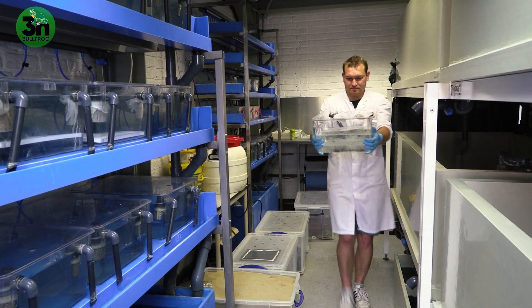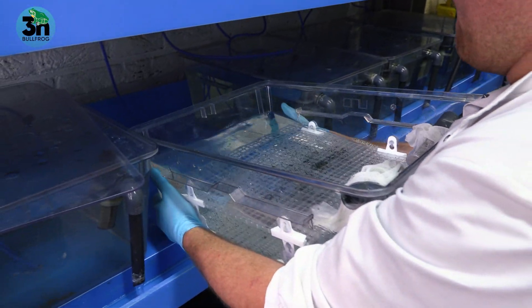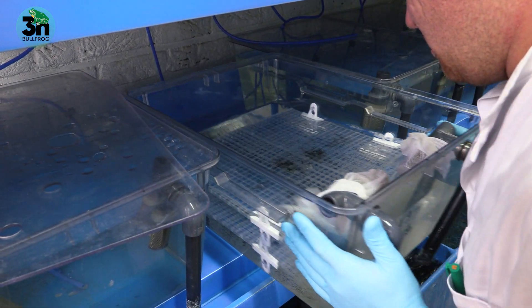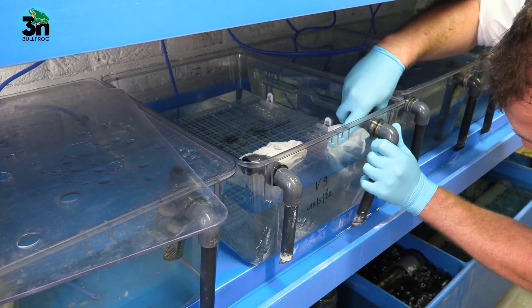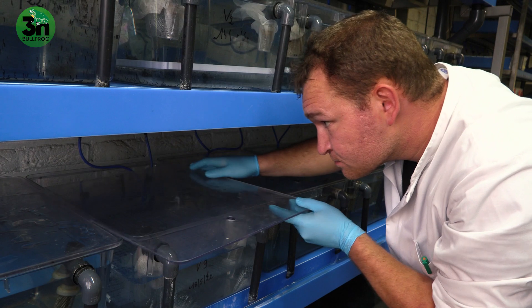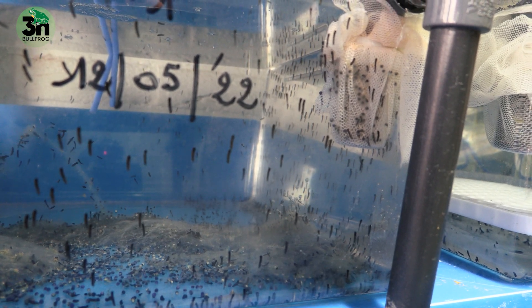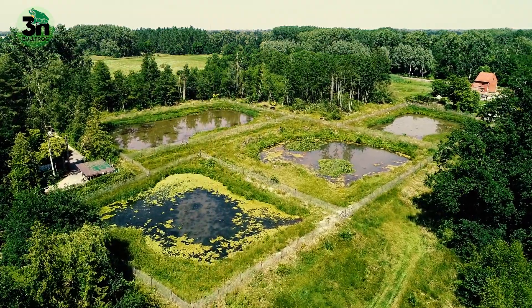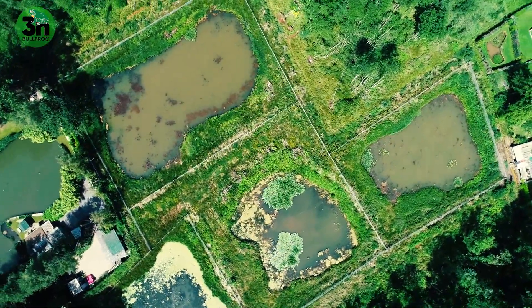The larvae will stay for one to two weeks and then we will transport them to the enclosures where they can grow in natural conditions. It is important that the larvae don't stay too long in the lab — that's why we choose one to two weeks after fertilization, because they need a mix of algae to flourish. In the past we raised them for several weeks in the lab but their mortality was way too high. That's why we built enclosures that are ponds, fenced so we can control, follow, and study the development of the larvae, sub-adults, and adult frogs.